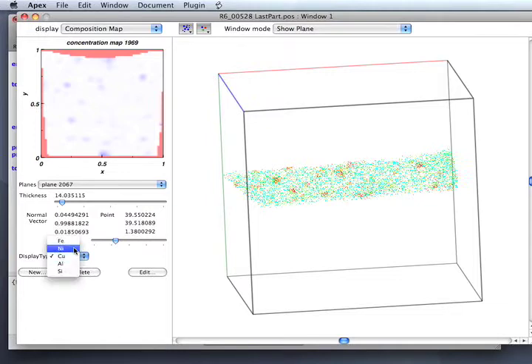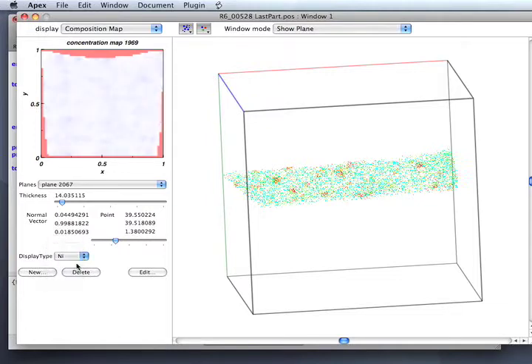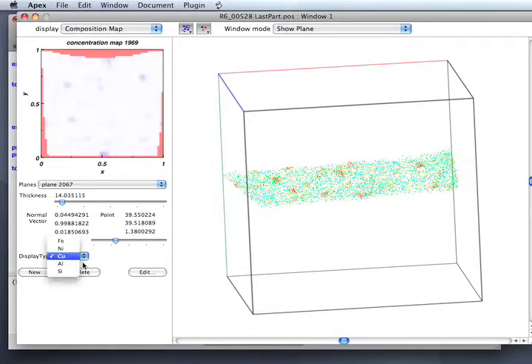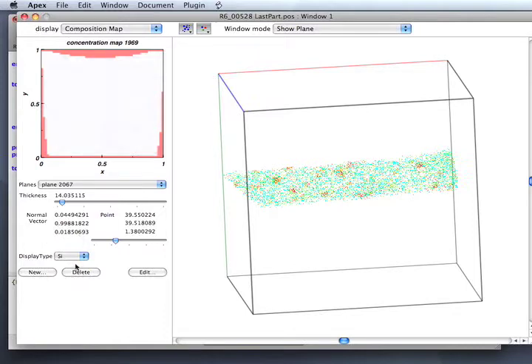Then we can show nickel. We can show aluminum. The aluminum and the copper precipitates are correlated.